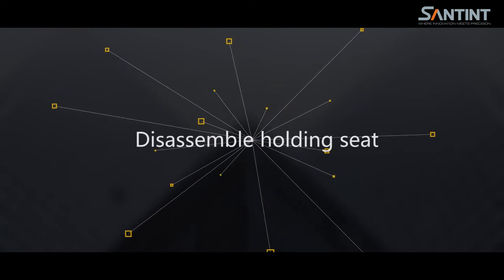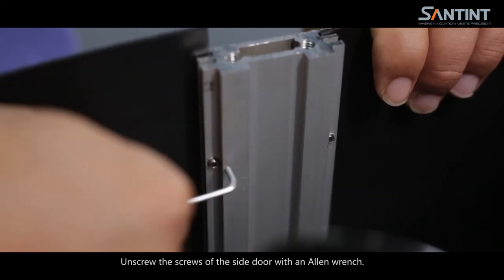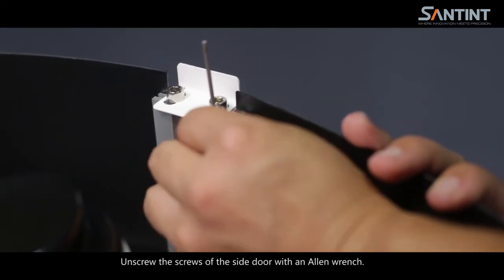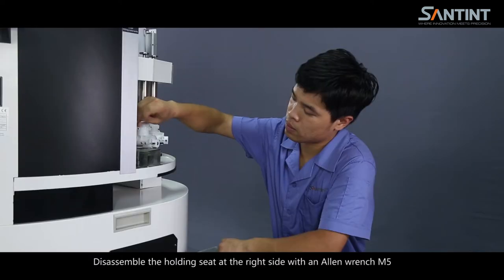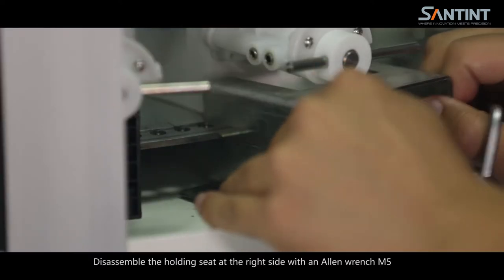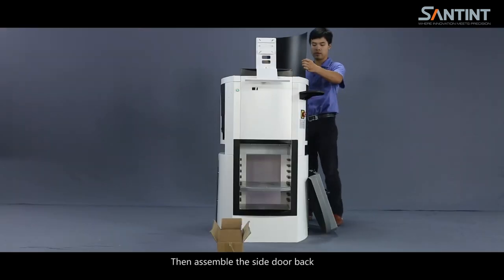Disassemble the holding seat. Unscrew the screws of the side door with an allen wrench. Disassemble the holding seat at the right side with an allen wrench M5, and then assemble the side door back.